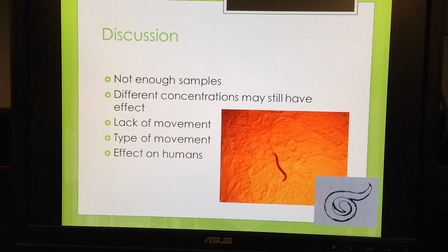The worms in our experiment also had very hesitant movement, as they were possibly searching for uncontaminated areas. C. elegans have sensors along their body for environmental factors, which could be an explanation for this. The worms in our experiment also circled, a technique for removing substances from their body, much more than worms on normal agar. One possible explanation for this would be that something in the fertilizer was irritating the worms.